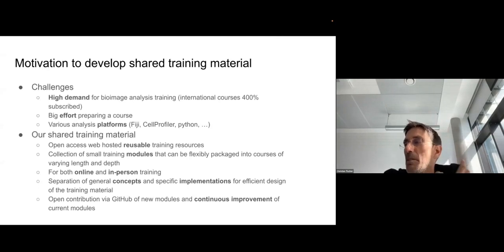For example, image thresholding. This is something you can describe on a whiteboard or in a textbook. You don't need any software for this. So this is one block, and then as you will see, we have specific implementations of how to actually do it, in Python, for example, or in ImageJ.